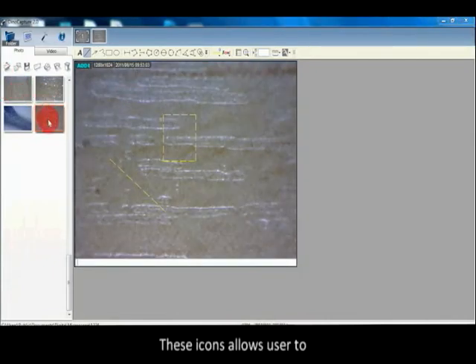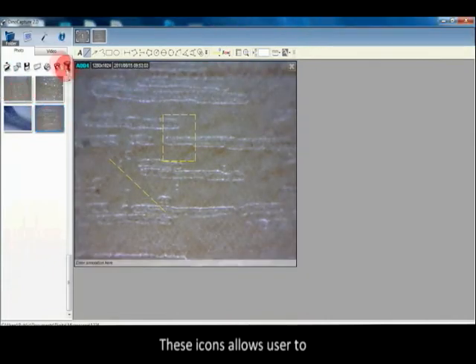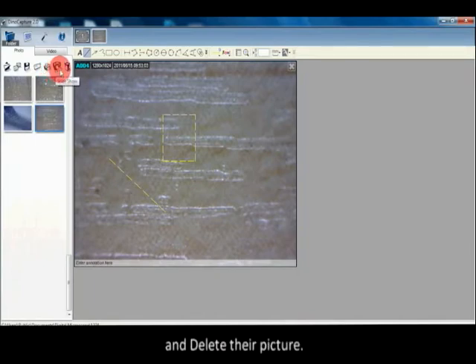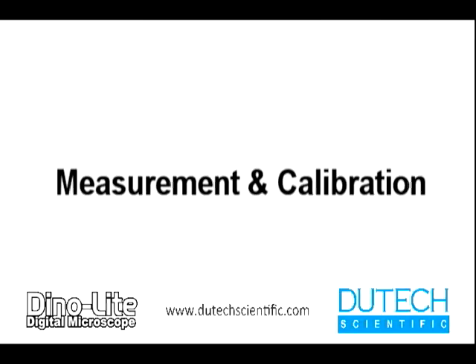These icons allow users to open, copy, save as, email, print, slideshow, and delete their pictures.